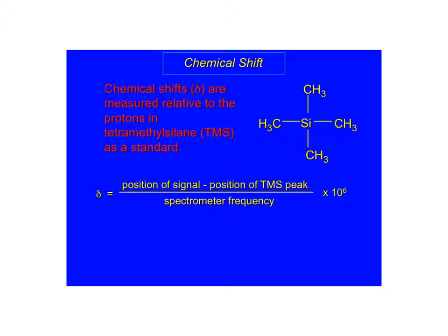And so the reason being is, what's the difference in electronegativity between carbon and hydrogen? Just as a review. They're about the same. Carbon is just slightly more electronegative, but it's about the same. Whereas silicon, is it going to be more or less? Like, does anyone know? We don't have a periodic table in here. But it's even less electronegative, right? Because it's below carbon on the periodic table. And so because of that, it's actually going to be giving some of its electron density away. And so that's why they consider the methyl groups in the tetramethylsilane perfectly shielded, I guess, if you want to speak it that way. And so where it comes out on the spectrum, that's 0. That's the 0 point. And then things need to move downfield or upfield from that.